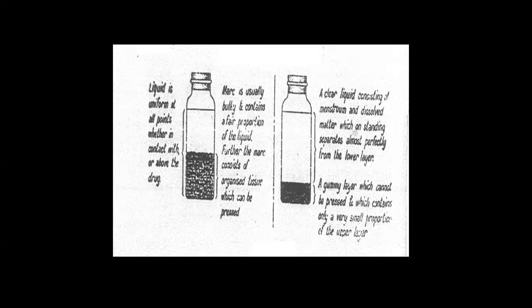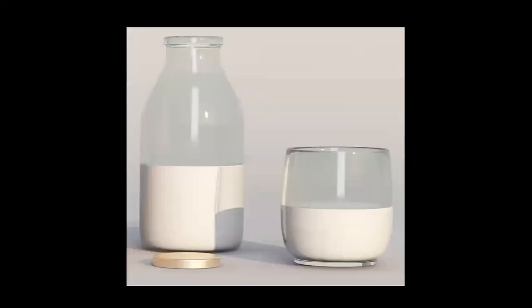So that is the major difference between the organized drug and unorganized drug, and why the volume should be adjusted or should not be adjusted. In case of unorganized drug, whoever the person is or whatever the process you adopted, if you pour 10 ml or 100 ml of menstruum, after a period of the maceration process, you'll be getting back the same volume.